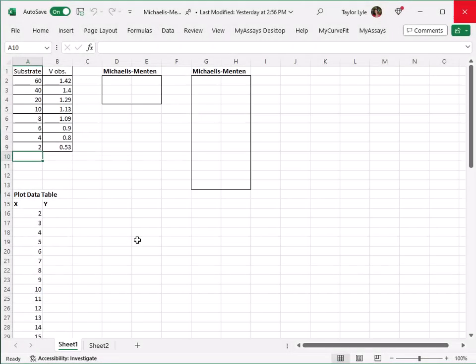In this video, I'll demonstrate how to use the MyCurveFit XL add-in to perform a Michaelis-Menten curve fit from directly within Excel without the use of Solver. Using Solver to perform a Michaelis-Menten fit can be difficult as it requires estimating the Km and Vmax values, calculating the theoretical velocity and squared sum of differences, and then optimizing the fit. With the MyCurveFit XL add-in, all that's required is your X and Y calibrator values.